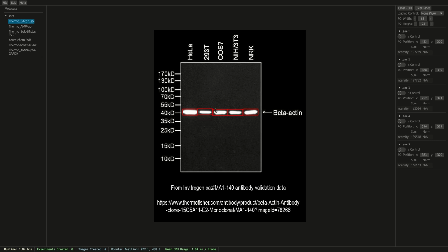So you're still getting a consistent region of interest, but it allows you to control the width and the height to better fit your regions. That's pretty much the only method you can use to adjust the width and height. We currently don't support individual ROI width and height, but that may be something we can do in the future if it makes sense.